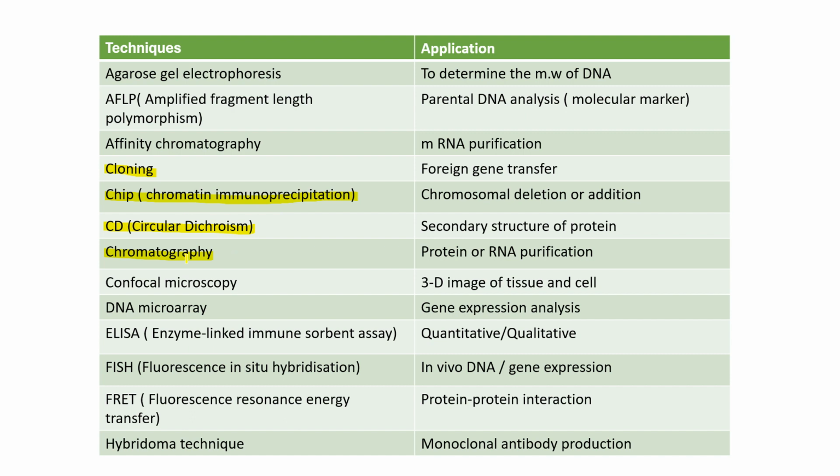Okay, then confocal microscopy. Microscopy also has various types: confocal microscopy, phase contrast microscopy, electron microscopy. But in confocal microscopy, what is the application? 3D image of tissue and cell. Okay, 3D image of tissue and cell by the confocal microscopy.